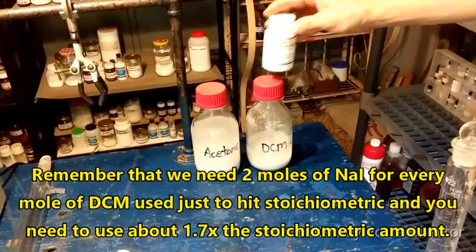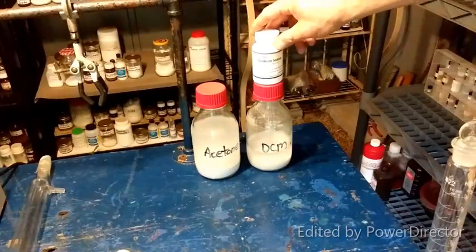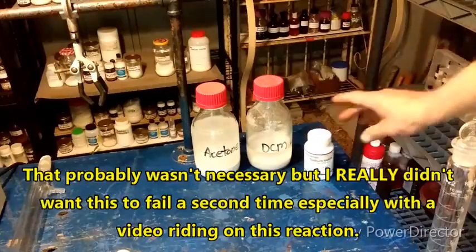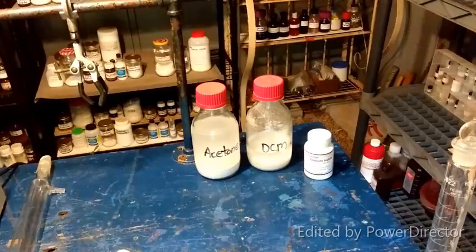Here, the sodium iodide, I dried this out in the desiccator over freshly charged 3 angstrom molecular sieves for several days. This stuff is as dry as it's going to get. I think that in order for the reaction to proceed as efficiently as possible, it does need to be as dry as possible.